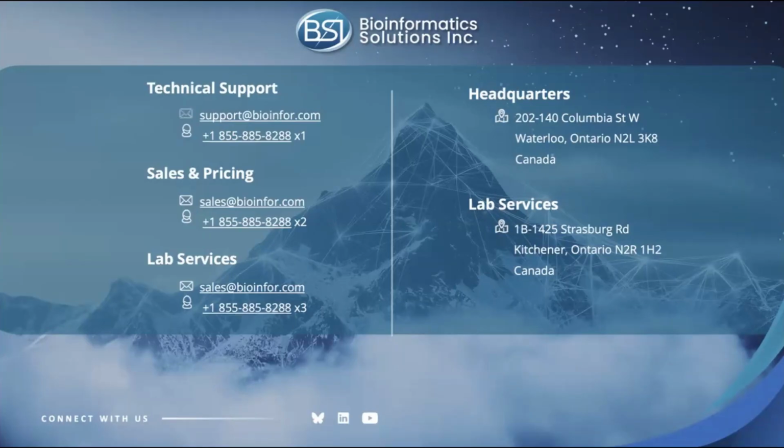As a conclusion, ProteoformX enables comprehensive, flexible, and precise proteoform analysis. So we provide multiple level analysis and give you flexibility for complex molecules, and also biopharma ready workflows.